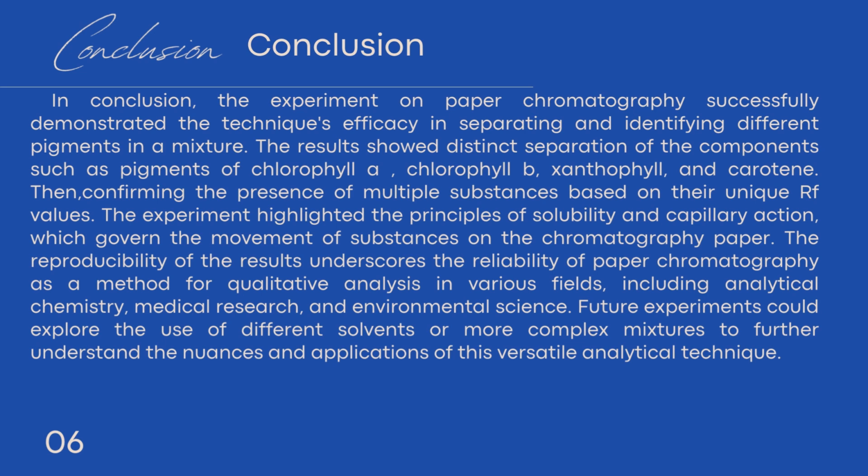The reproducibility of the result underscores the reliability of paper chromatography as a method for qualitative analysis in various fields, including analytical chemistry, medical research, and environmental science. Future experiments could explore the use of different solvents or more complex mixtures to further understand the nuances and application of this versatile analytical technique.